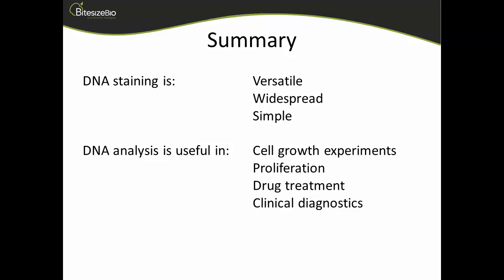Exactly, yes. The second one here is, which dye would you personally consider the gold standard? Our gold standard technique here is ethanol fixation of cells and propidium iodide. Some people seem to prefer to use DAPI. I think that does depend on the setup that you have, because as well as having the right laser wavelength, the signal you get from your DNA dye also depends on things like the strength of the laser, the power of the laser. Sometimes it's easier to vary that with, say, UV lasers that used to be attached to sorters. Okay, it's going to be determined, I guess, by what facility and what works in your setup. So the major advantage for us of fixing in ethanol and propidium iodide is it's so easy.